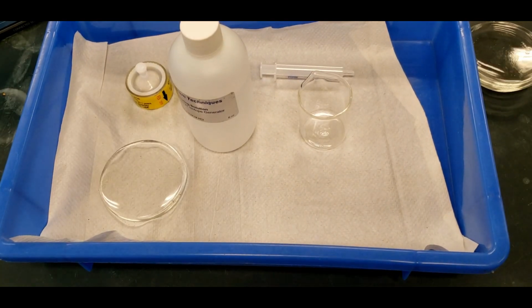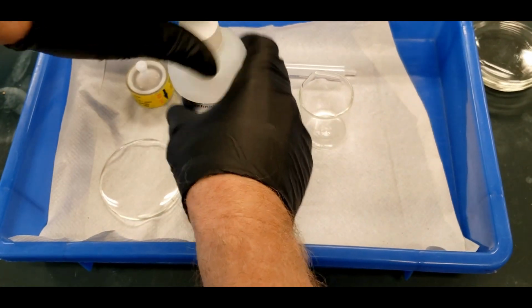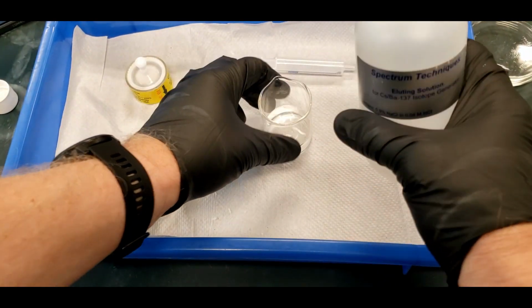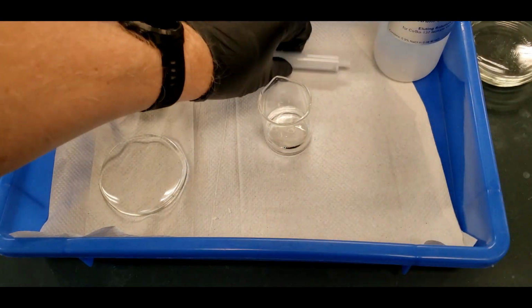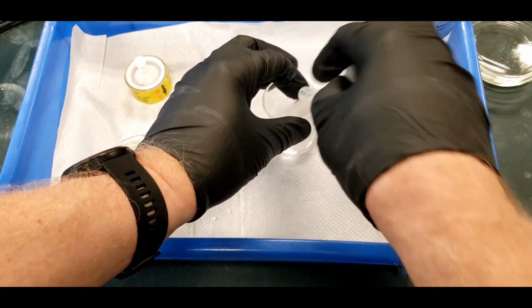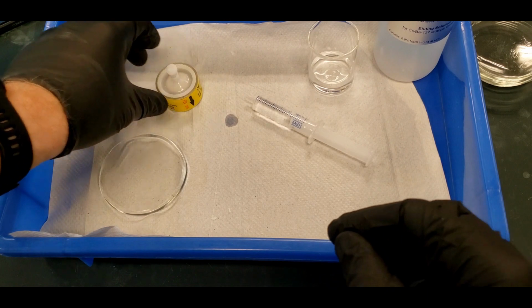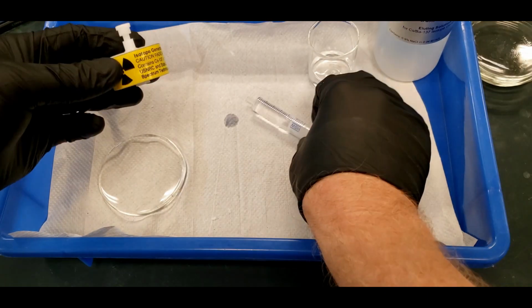Okay, well, we want to get our barium-137 sample. So this is saline solution. Put this in a beaker. And then we're going to draw up some of the saline solution. Usually I have 8 of them that I have to make per class, but it's just this one here. Now, so it won't need very much.